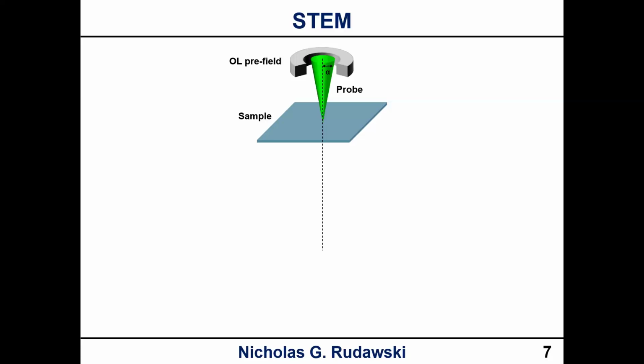Okay. We got some nice little follow-up questions on that one. Again, from Ching Tao Ku, in terms of magnetic domain mapping, is there any difference between Lorentz mode and DPC?